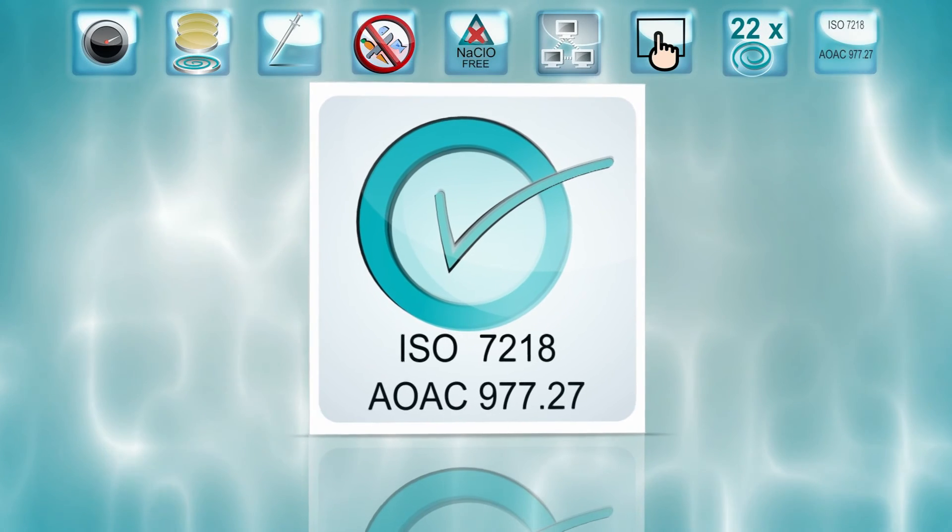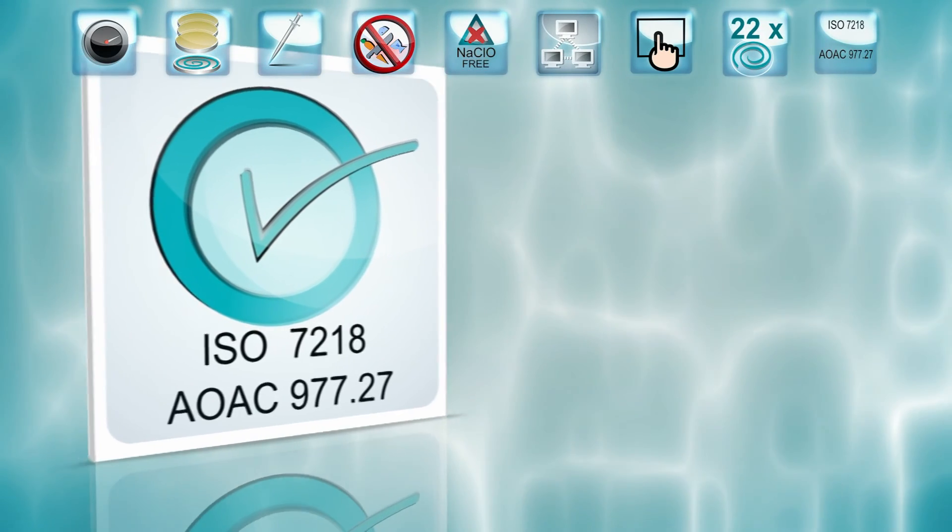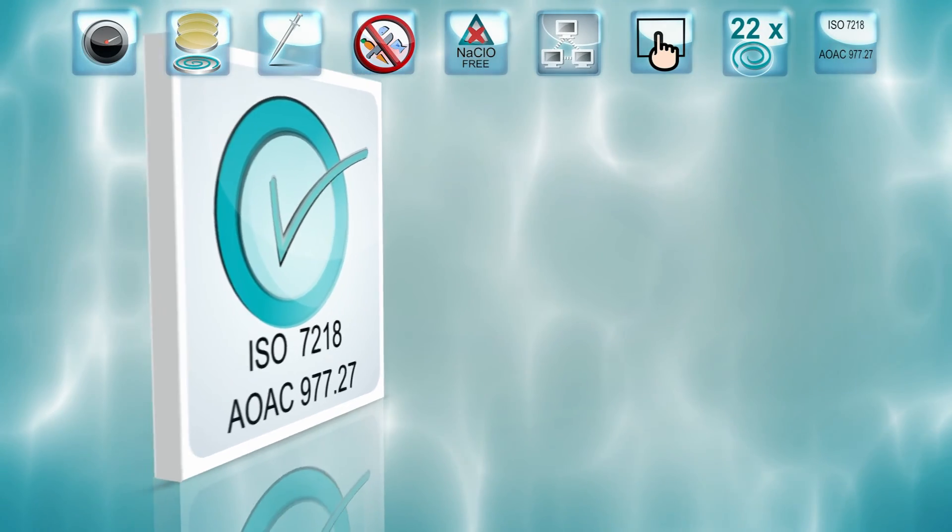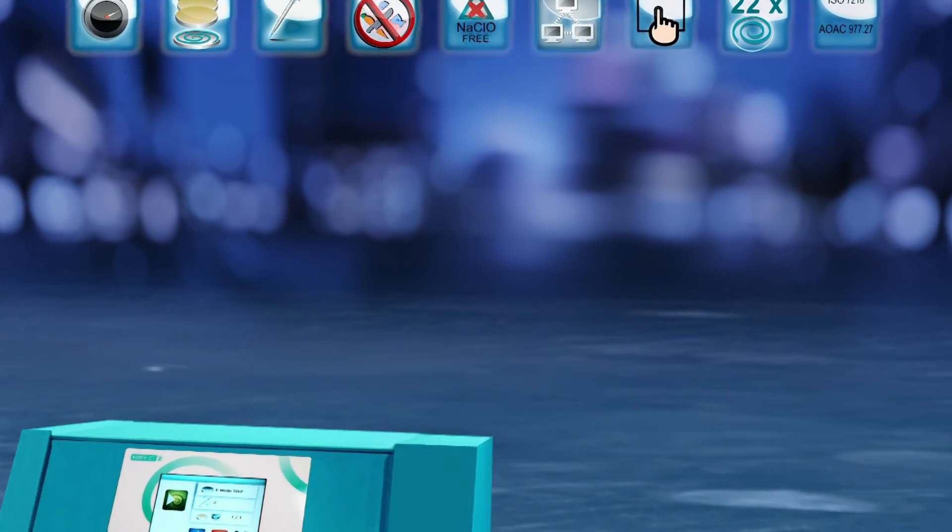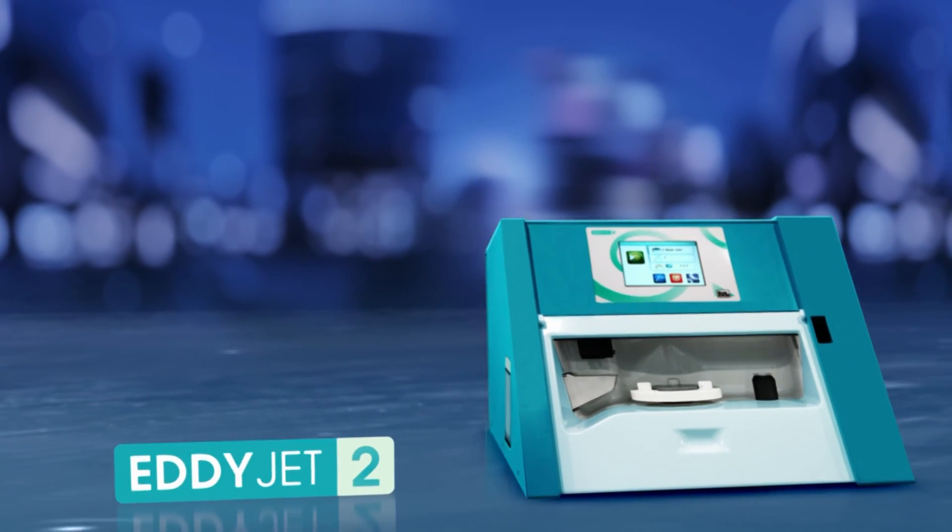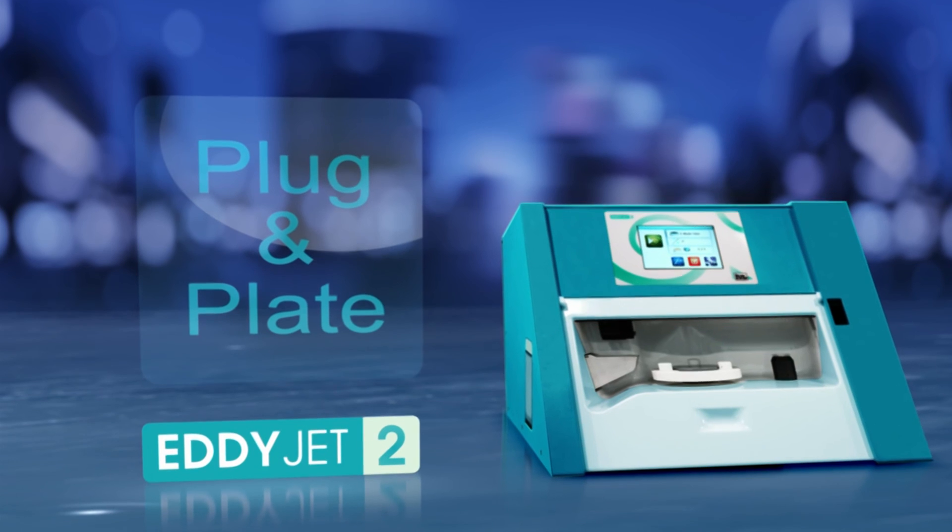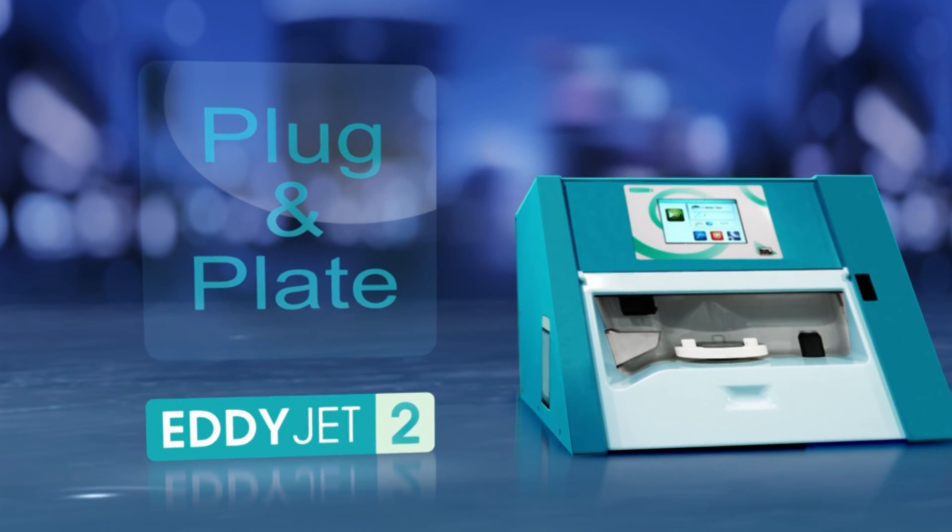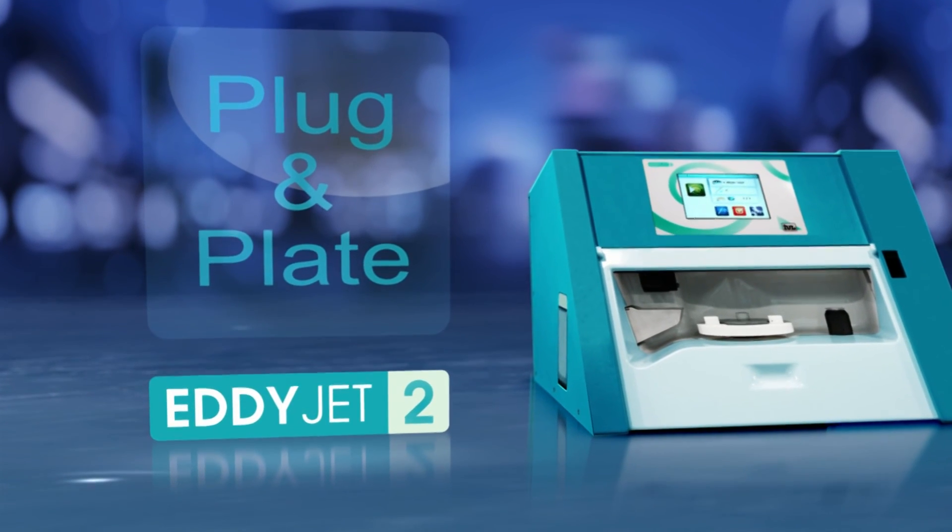Spiral plating is an ISO and AOAC-validated microbiological method. Sterility, a streamlined workflow, user-friendliness, and speed make Eddy Jet 2 the most productive spiral plater.